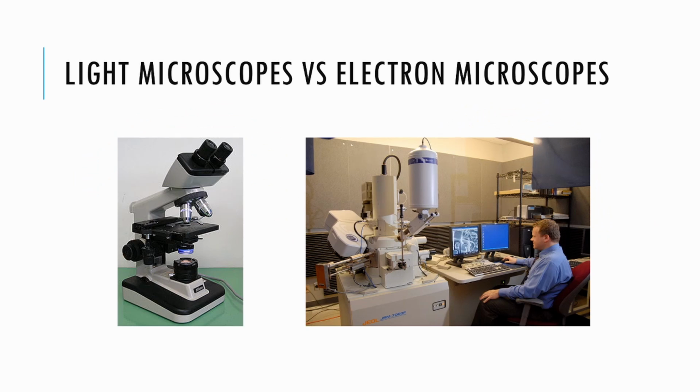Now, we mentioned light microscopes, and we said that there were other types as well. We're going to focus on the light microscope, but let's introduce the idea of the electron microscope as well. And there's some pretty big differences between these. The light microscope is what we see here. And so this is probably what you're going to use for the most part in your life science career, a microscope that looks something like this, where you have some pieces for you to look through, some various magnifying pieces on the inside and the objectives, the light source coming from the bottom and illuminating whatever you are looking at that would be held here on the stage.